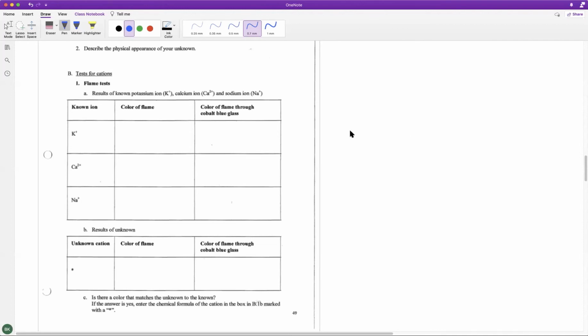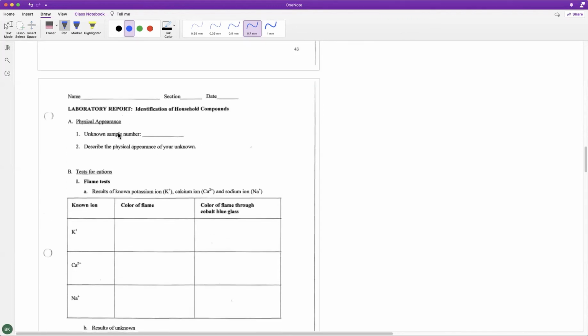All right, so the first thing that you'll see on the video, we're going to start out with part B. You don't need to worry about the physical appearance and the unknown number. I'm going to just write it out for you here, because we're only going to do one unknown. That's going to be unknown B, and the physical appearance is a white solid. So those are the two things we know about our unknown, some white solid.